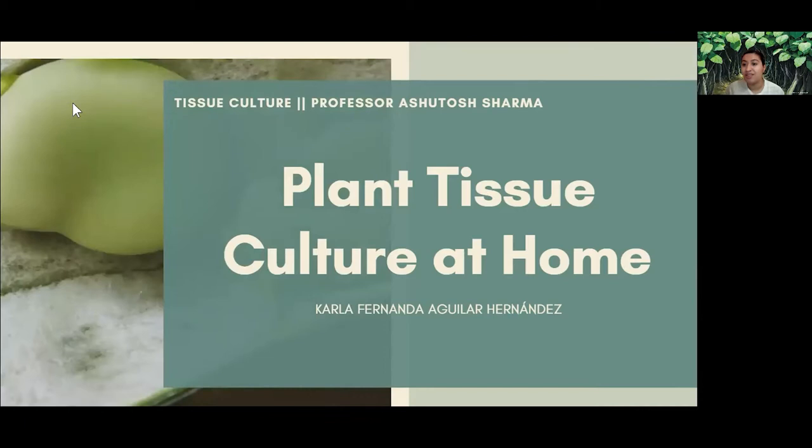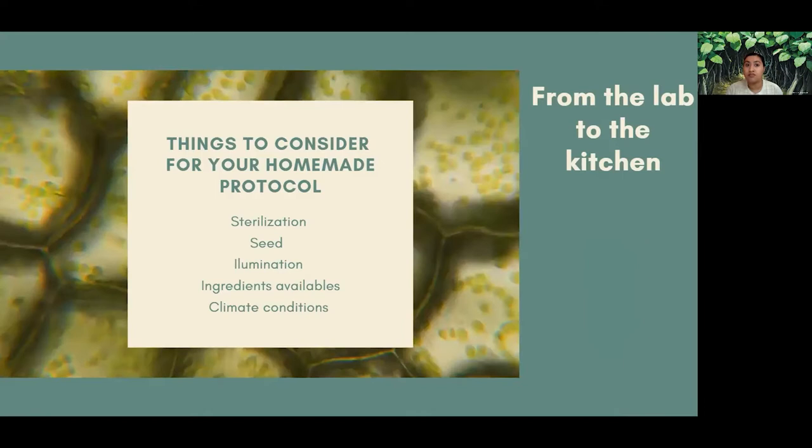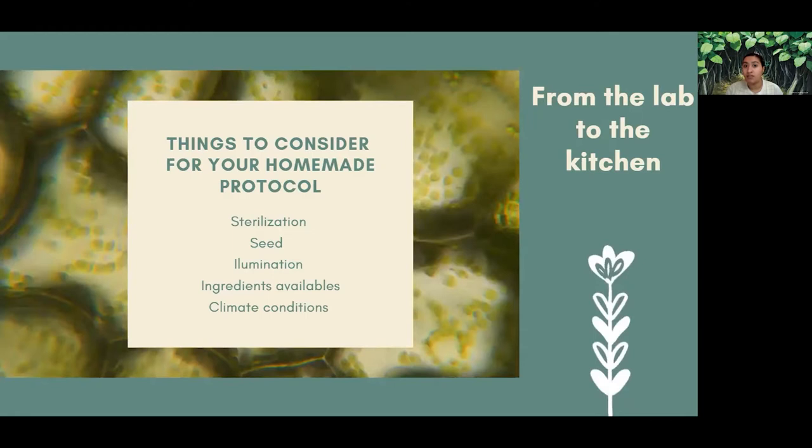So first, things you have to consider when doing your protocol. You have to take into consideration the sterilization and see what you are going to work with. Also, be mindful of the illumination of your house and the ingredients and climate of your region so you can know what you are working with.